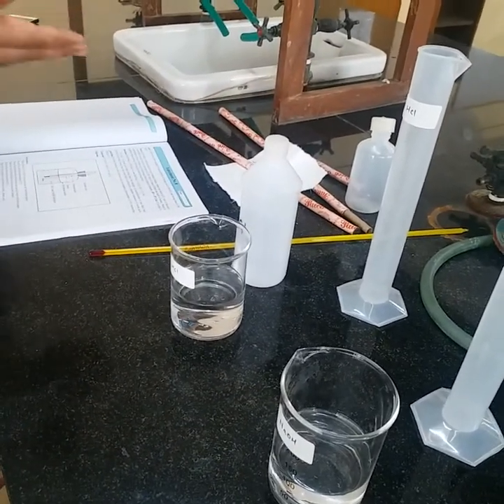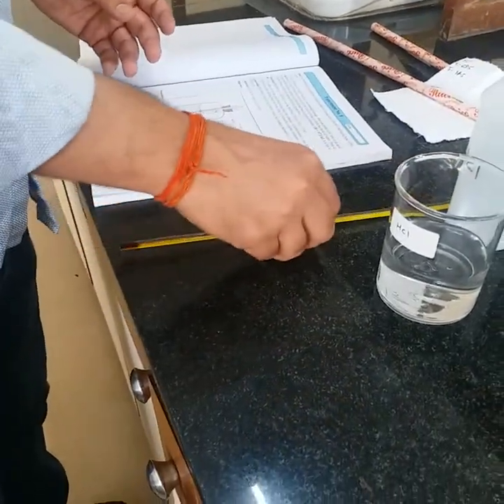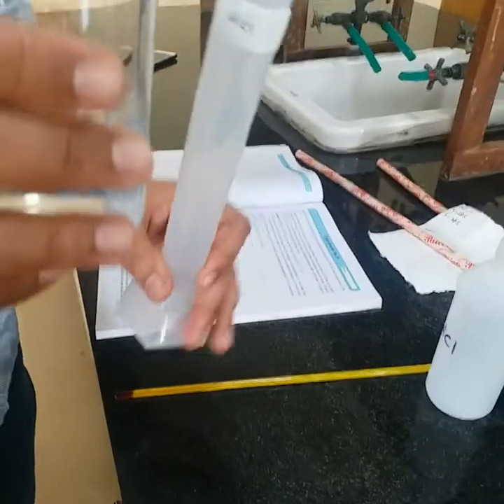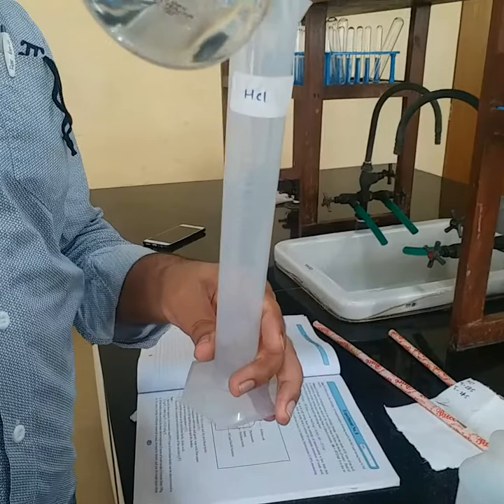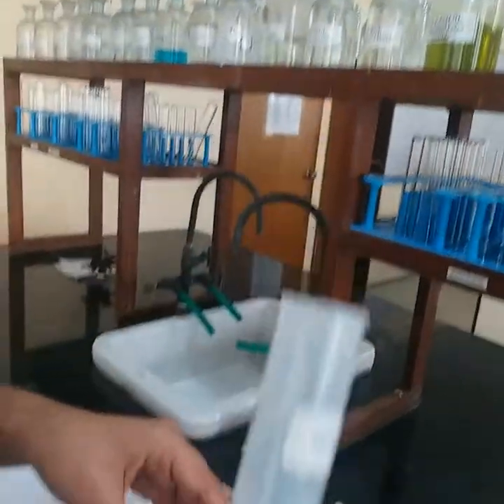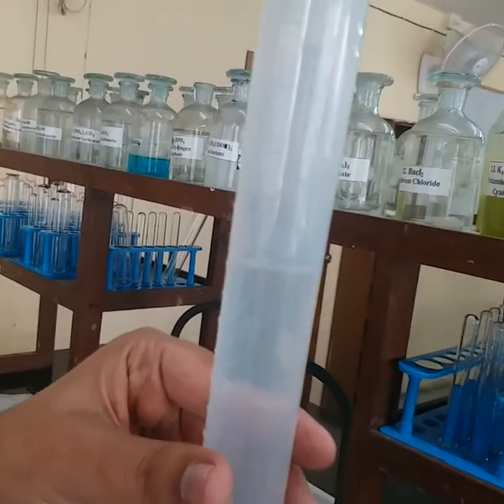This is the thermometer that we have for measuring the temperature. For the first step, we have to take the HCl in the HCl cylinder. As given in your manual, that is 50 ml of HCl. As you can see, 50 ml — if it is a bit excess, you can remove it. So 50 ml at the lower meniscus — I have taken the HCl.